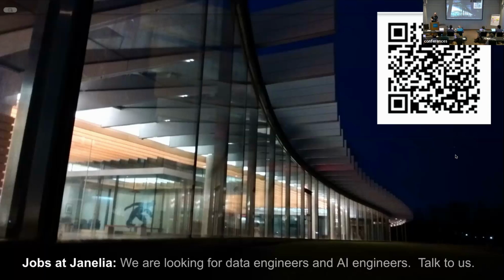Where it actually hurts to have these really big blocks is if you're training something like cell segmentation, and you actually want to train it with random cutouts from your training data set. Then having 3D blocks means loading a block-size amount of data more than you actually want. So in those cases, it is usually very practical to make a small re-export for the training pipeline, and then it's just done.